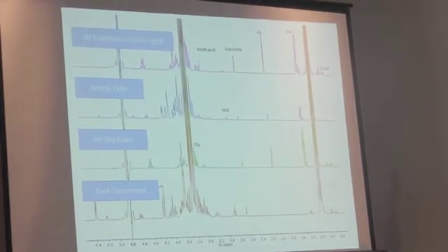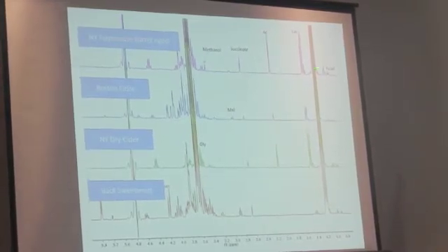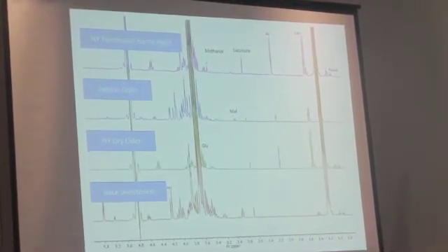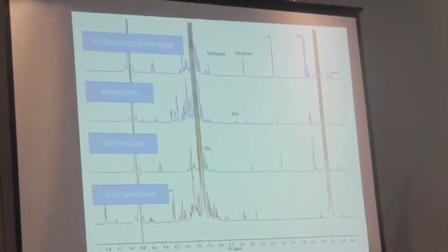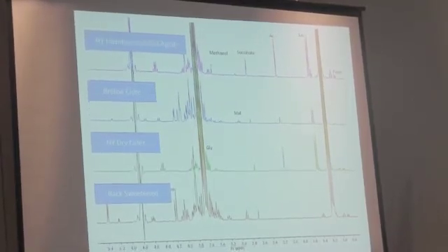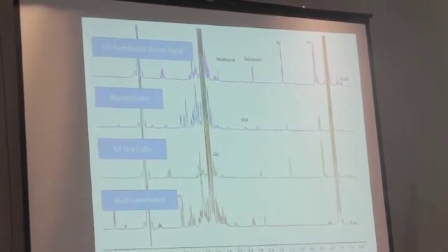So there's a terroir there. So if you're putting honey in your wine, there's something you can do, but I don't know how you do that. The other thing you could bring in is elemental analysis of your water, because that's a whole other thing that's particular to your place where you're making your cider. So if you have a metals analysis of what's in there, that might be something you add to a chemical analysis.